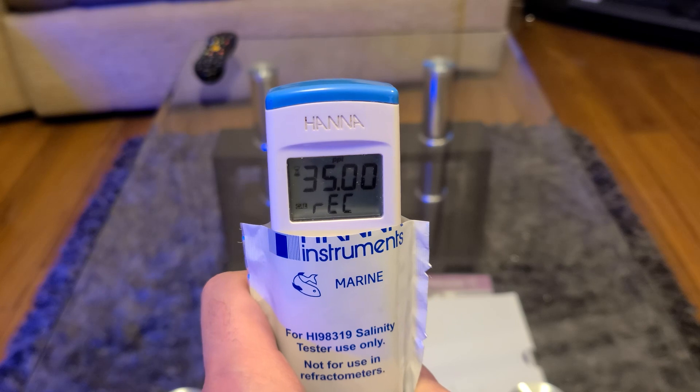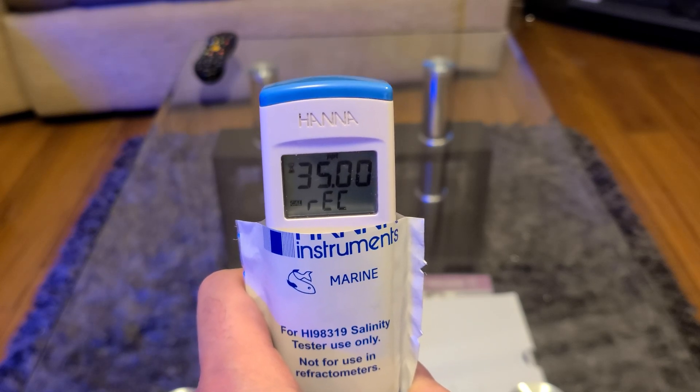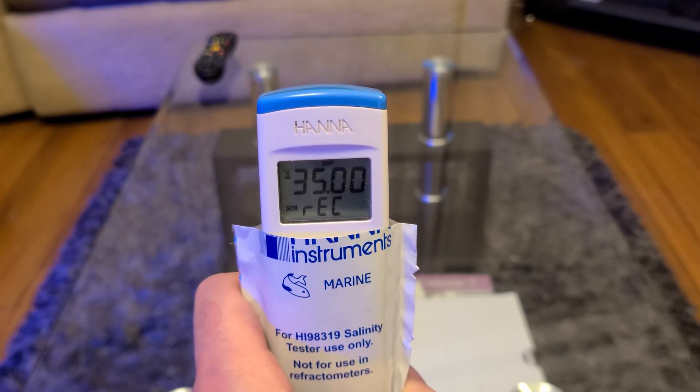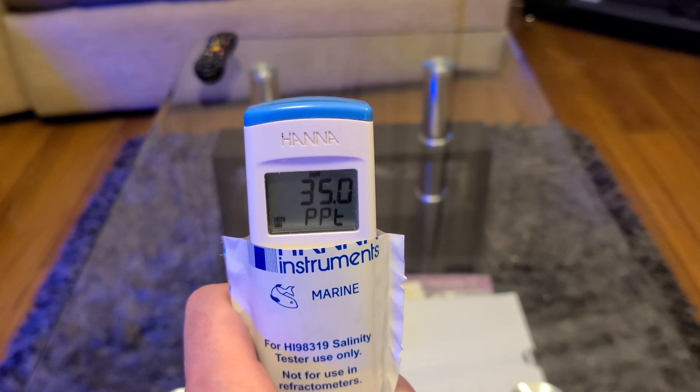In an ideal world you'd want to calibrate this device every single time you use it, but I can see that getting laborious pretty quickly, not to mention expensive. So once a month is good enough for me.